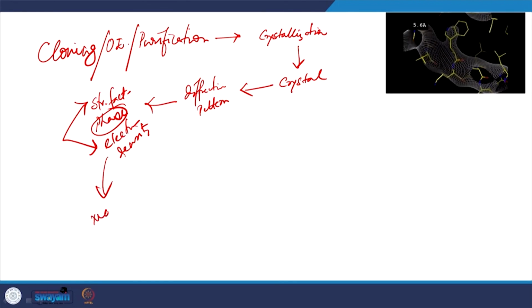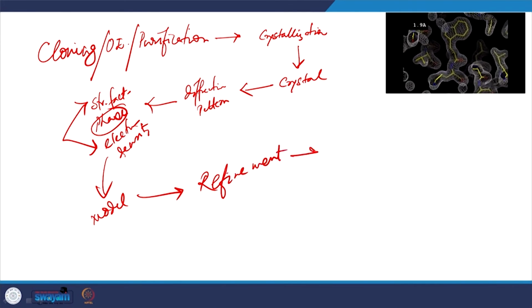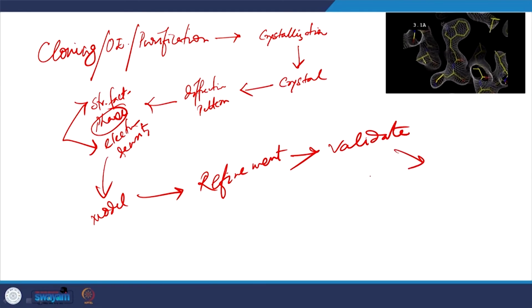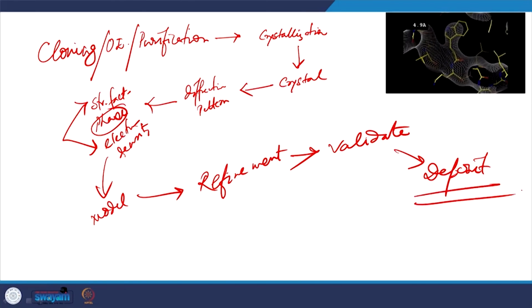From there we have a model, we have done refinement, then validate, and ultimately deposit the structure. So, that is a long journey of learning the X-ray crystallography technique.